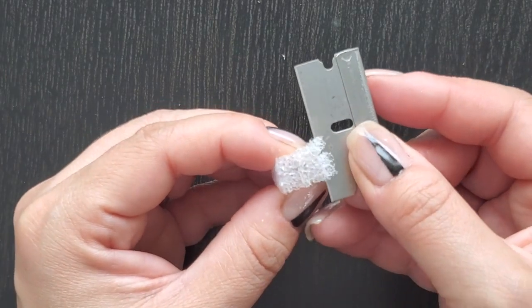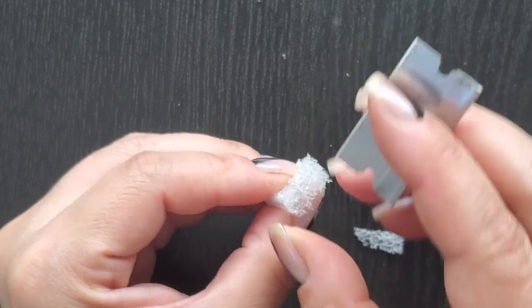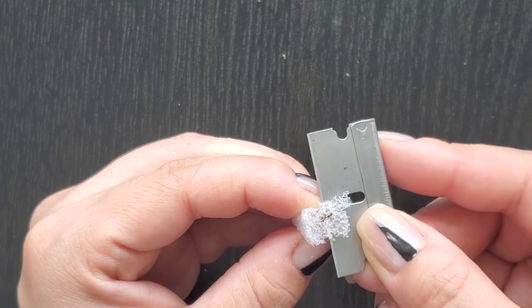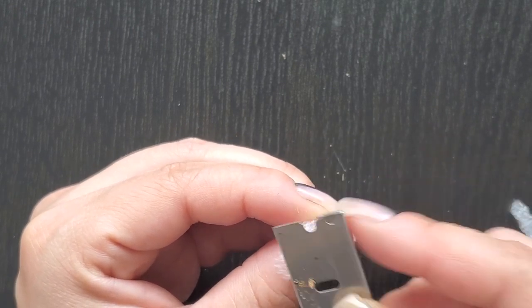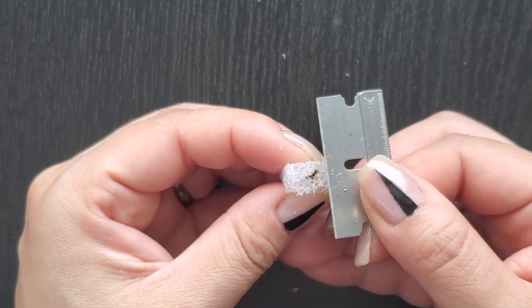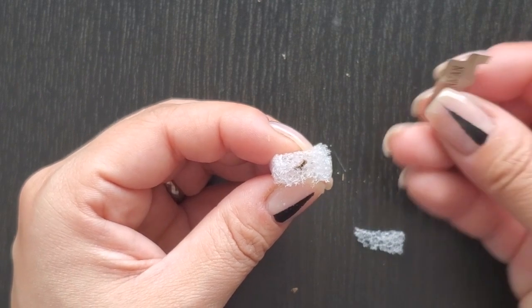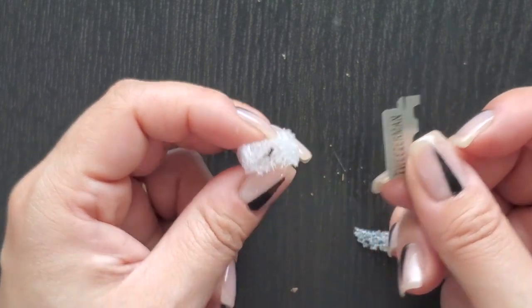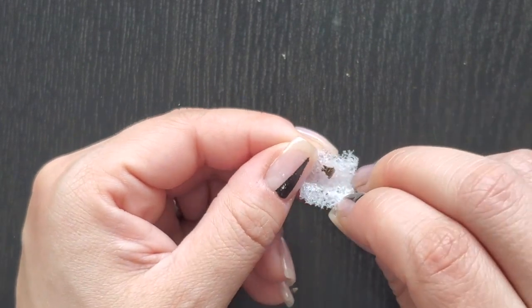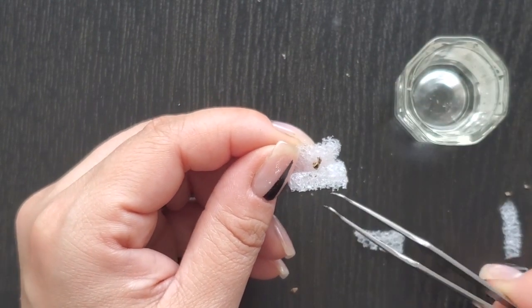Then you would cut. The first cut's a waste because you're just trying to get the Styrofoam flush with the actual tissue you're looking to cut. So this one usually wastes a lot of the blade, so you don't want to use your best blade on this. And then when it's ready and flush, you can switch to your better blade, something like this, and then you can cut through and it's way better. The reason I'm not going to do that is this is not the right type of Styrofoam, but this is generally the idea.